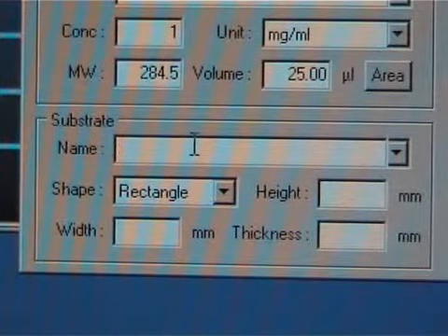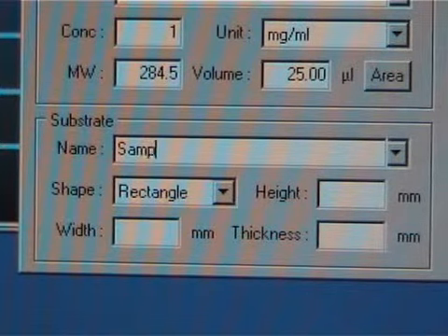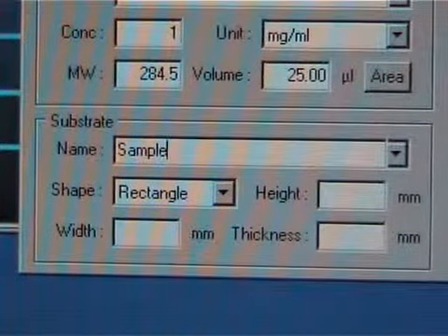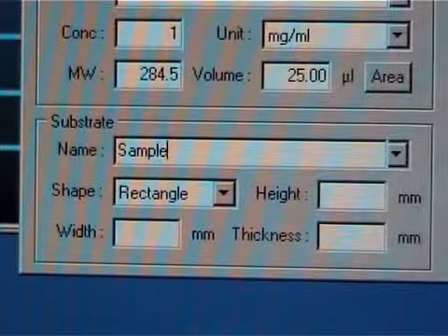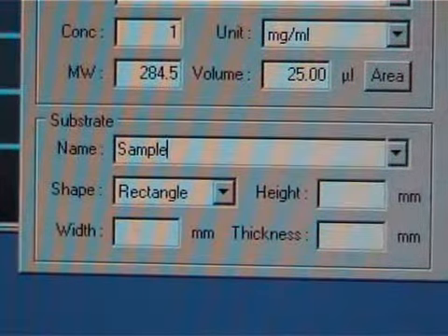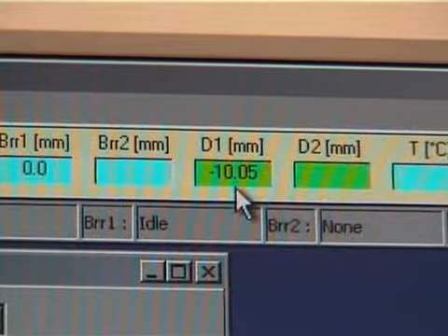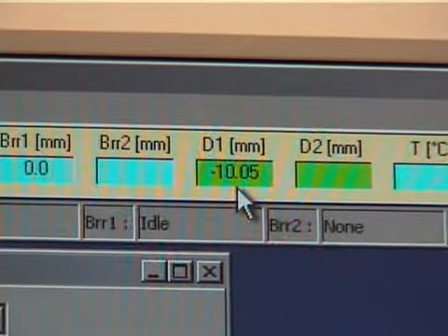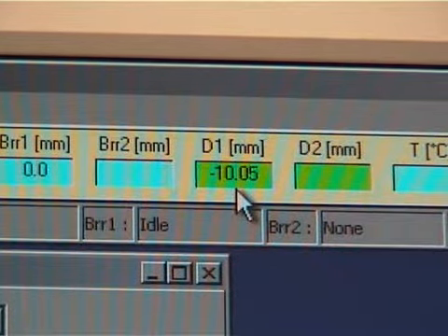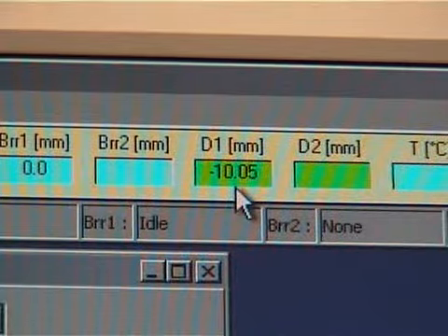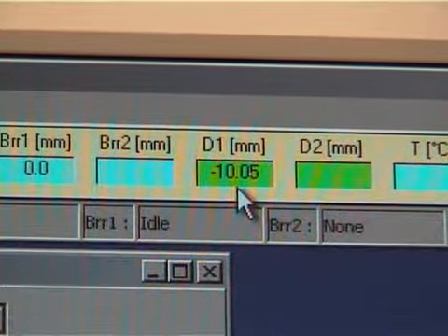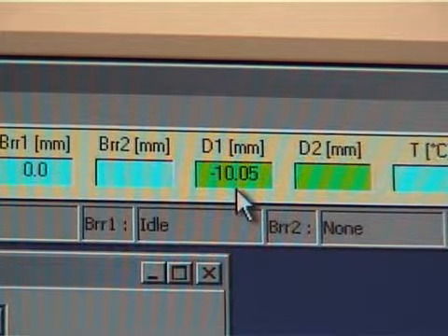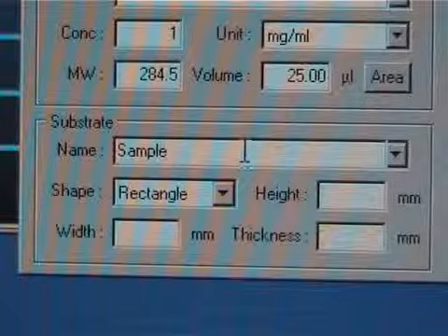Type the name of the dipping sample. Choose the right shape and insert the dipping height. In case of a hydrophilic sample, it is the same as the current dipping arm's position. That can be checked from the LB control software window as shown. Then fill in the other parameters.